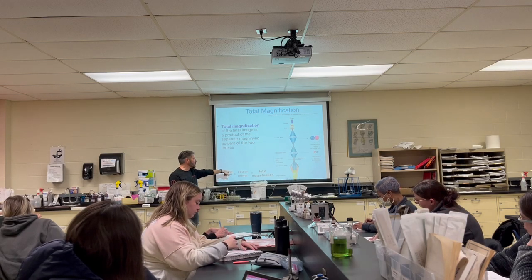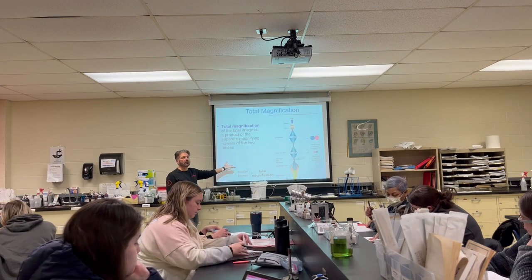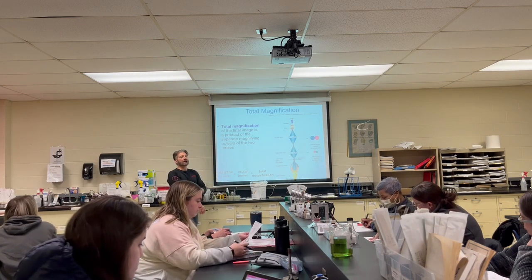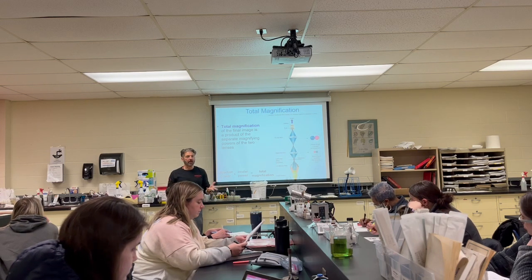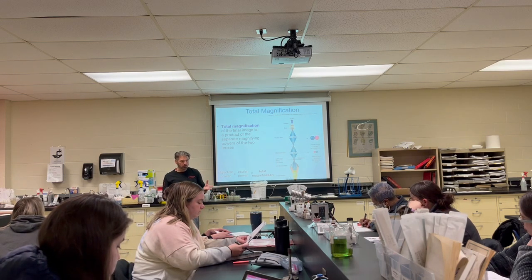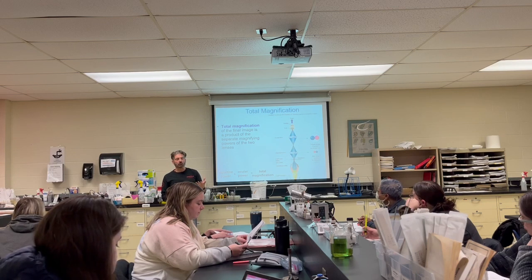It's objective towards ocular, ocular towards objective, that's your total magnification. So if I come over to you and say, Dr. Phil, I can't find this image, it won't come in, the bacteria won't behave, it won't stay still, or I can't find it, I'm going to say, what magnification are you on? And if you're on oil immersion and you didn't bring it into focus prior to that, well, good luck.